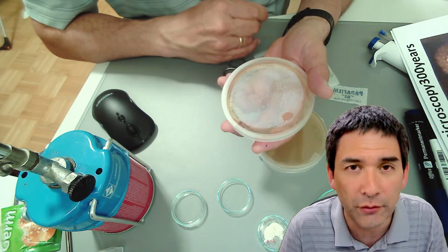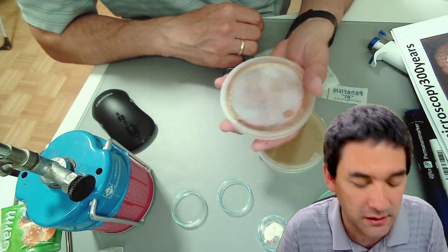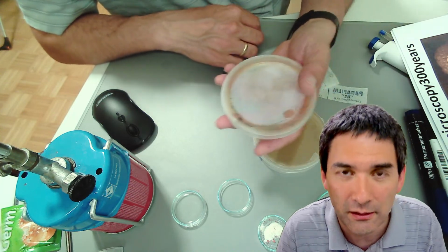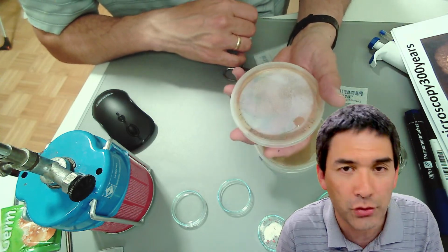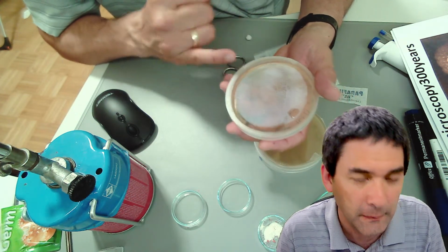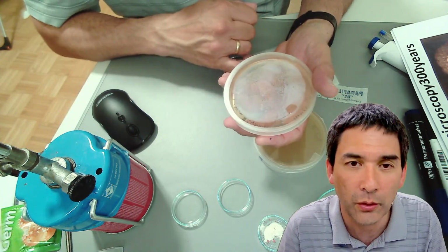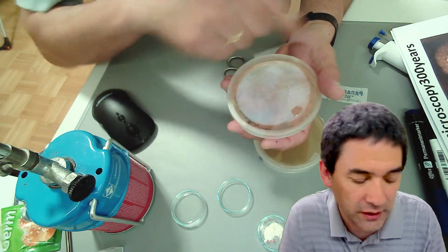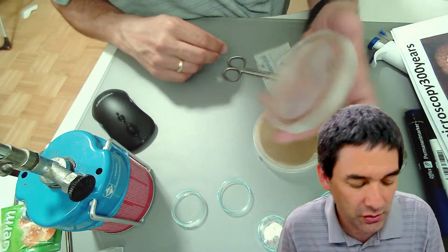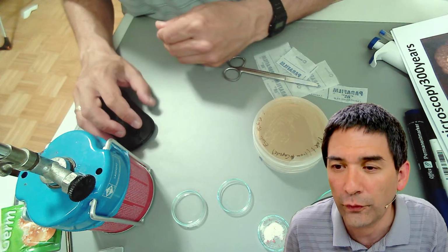And if you don't have an autoclave, you can put hydrogen peroxide over it. That's probably a little bit risky if you're not careful. Hydrogen peroxide is very effective in killing microorganisms, but some microorganisms form an enzyme called catalase, and then they will convert the hydrogen peroxide into oxygen, and there's a lot of foaming going on. So you have to be a little bit aware of that as well. Otherwise, it might start to foam quite a bit.